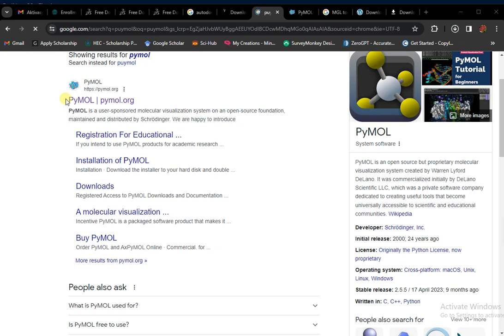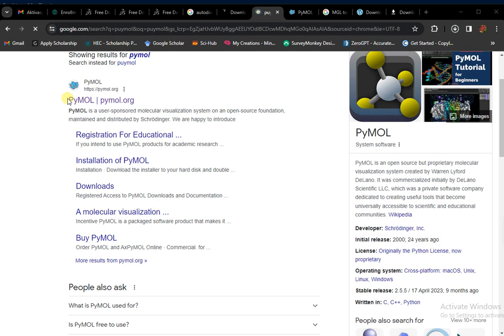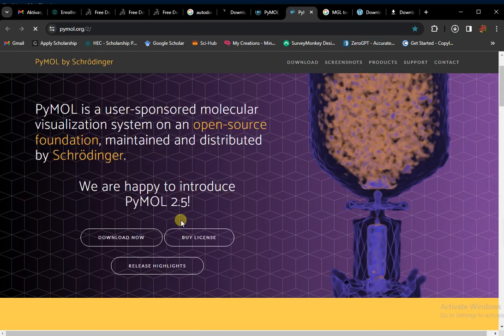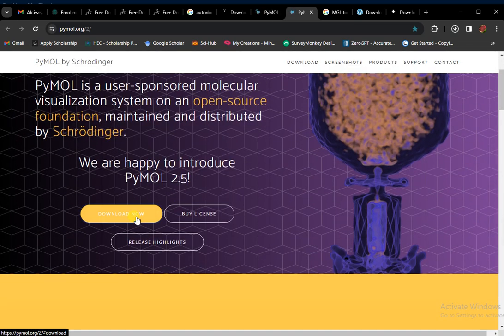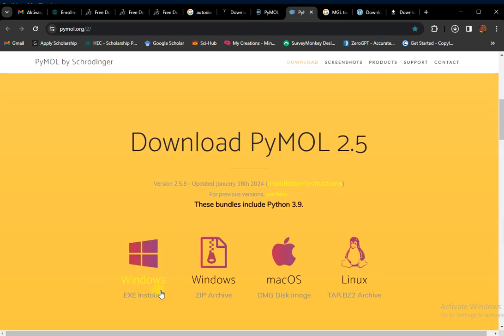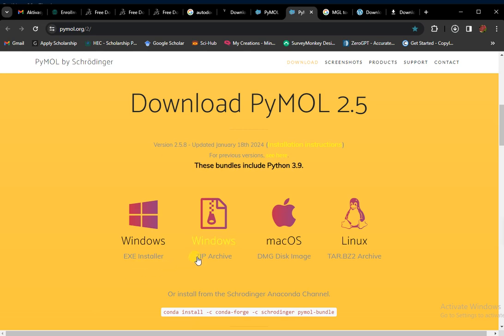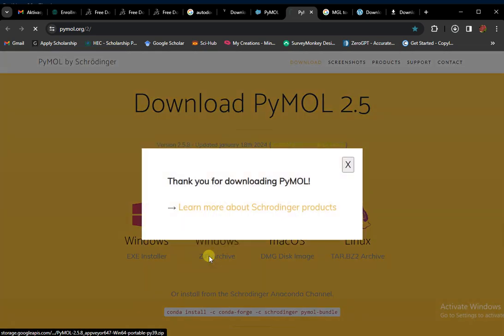The next software to download is PyMOL. Simply type PyMOL on Google and open the first website, which is the official PyMOL website from where you can download it. Tap on it — this type of website will open. As I am using Windows, I download the Windows zip archive file.